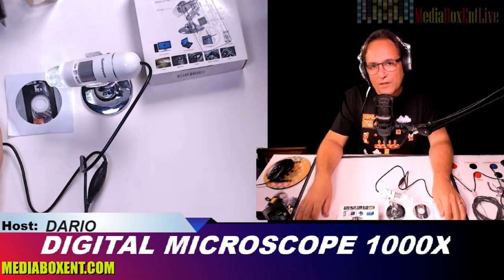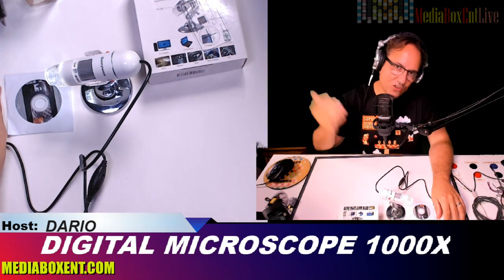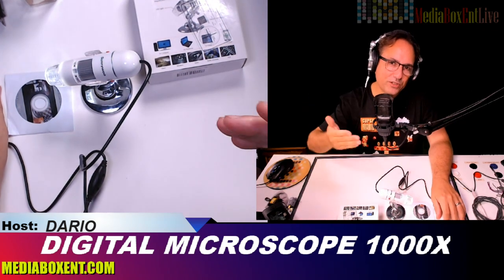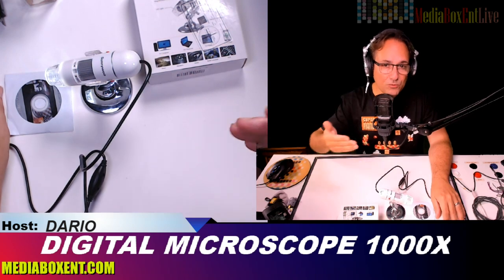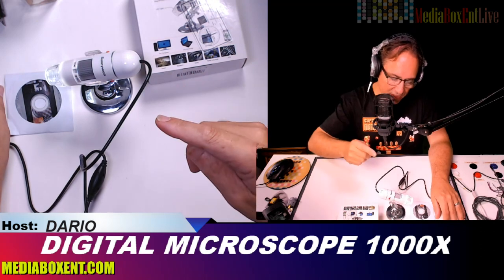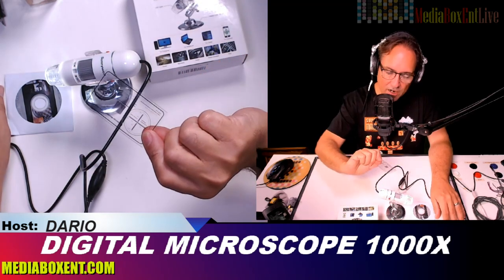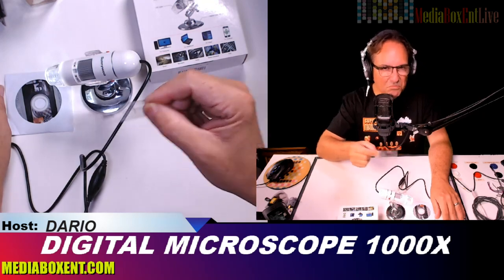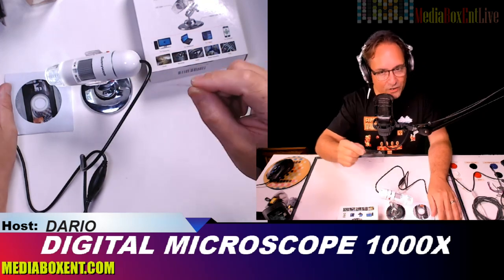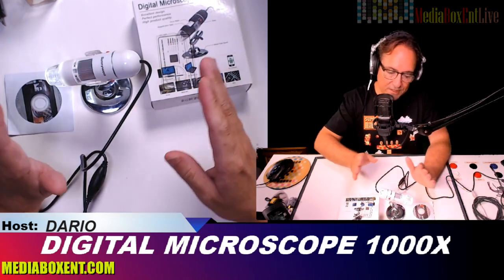Happy day everyone, this is David from Media Box CNT Blockchain. What we got today is a super digital microscope up to 1000 times magnification. In the box we get the microscope, a stand, an installation guide, and a little chart with numbers to compare magnification levels — it runs between 40 to 1000 times.